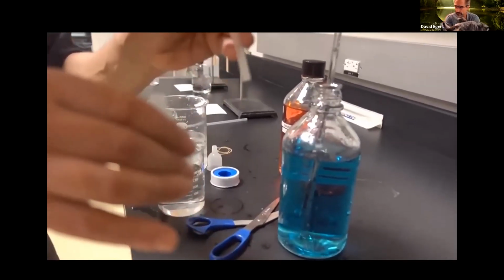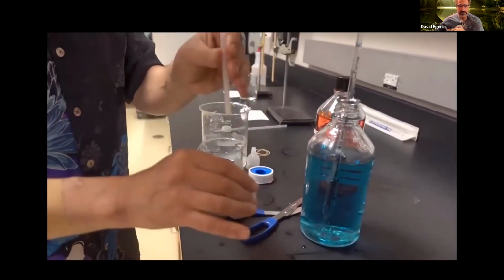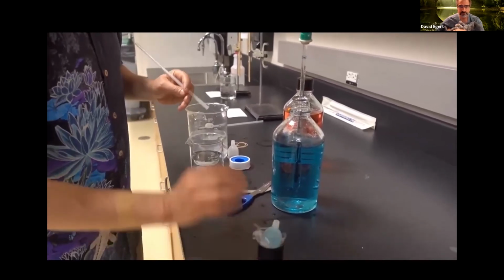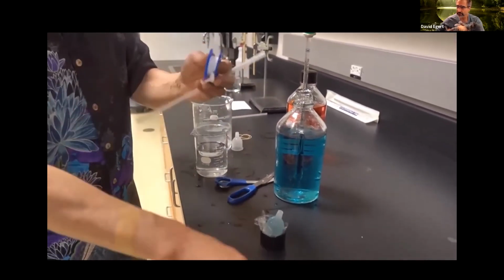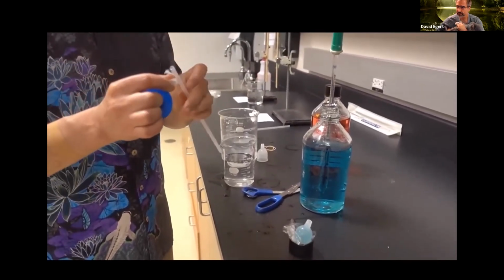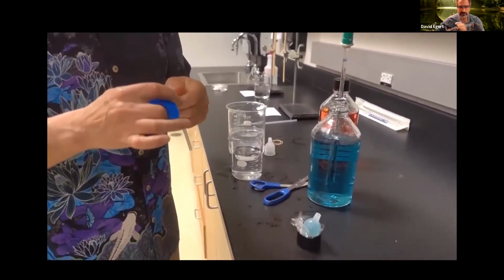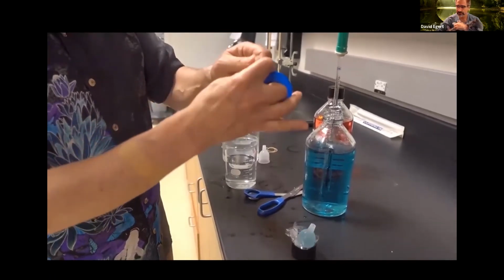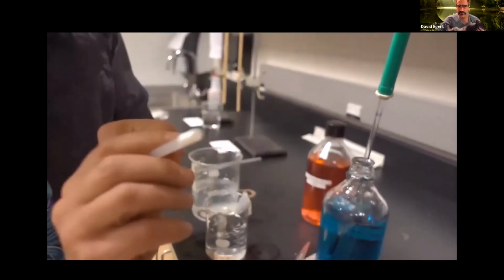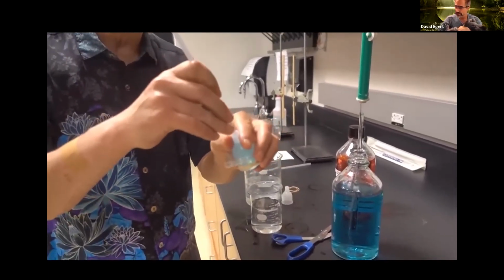Then what we need to do is put the tube into this funnel. We want to make sure, again, the sealing, making sure there's no leaks, is really important. So for this, I actually have Teflon tape, which is used for plumbing. If you haven't seen it before, it's incredibly useful for lots of household tasks, but it's really useful for osmometers. You basically wrap it around a bit, and you kind of pull, and it rips off. Make sure you haven't blocked the hole. And this is going to create a really nice tight seal when I kind of jam it in here.